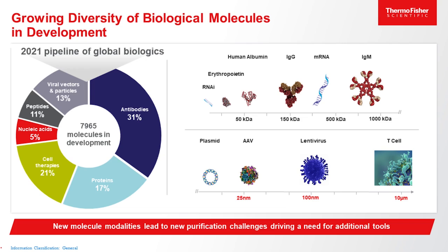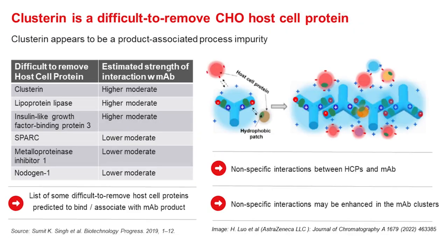So with this rise of new molecule modalities, this leads to new purification challenges, which drives the need for additional tools for purification. But just to speak a bit about antibodies and its workflow, we know that one of the major challenges is the removal of difficult to remove impurities, such as one of them host cell proteins.